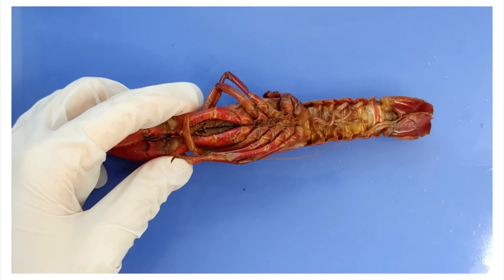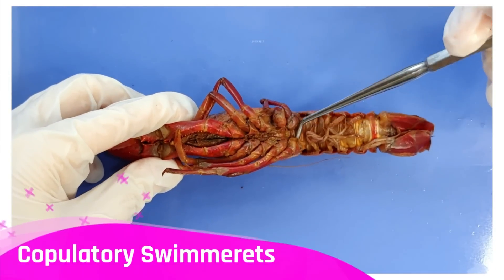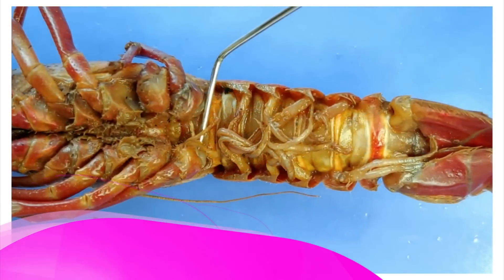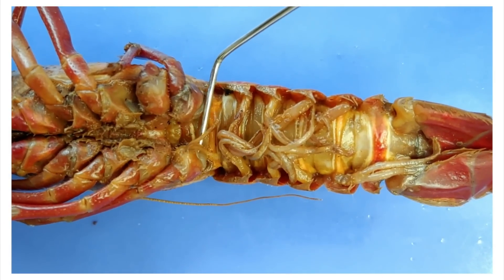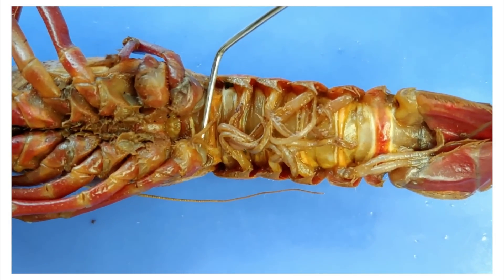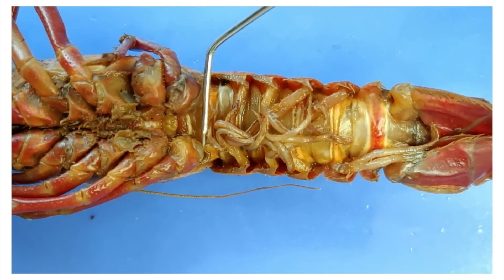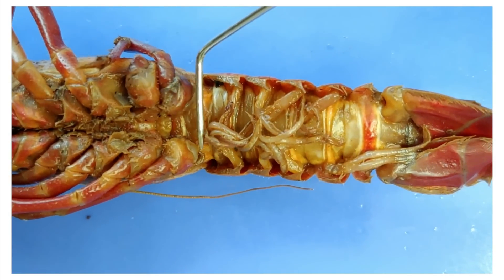In order to tell the sex of our crayfish, we can look at the first pair of swimmerettes, also called the copulatory swimmerettes. These copulatory swimmerettes are hard and long in males, but they're thin and feathery in females. So this one we have here is a female because these swimmerettes are thin and feathery.